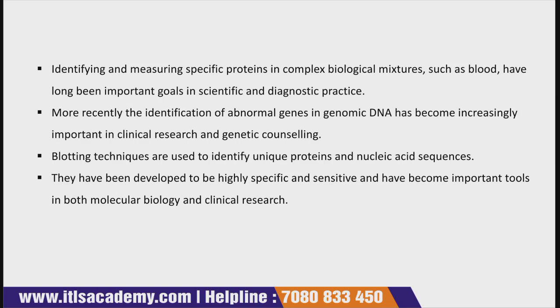The blotting techniques are also used to identify unique protein and nucleic acid sequences. So whenever you want to identify any unique protein or nucleic acid sequences, blotting techniques have a great advantage. They have been developed to be highly specific and sensitive, and have become an important tool in both molecular biology and clinical research.